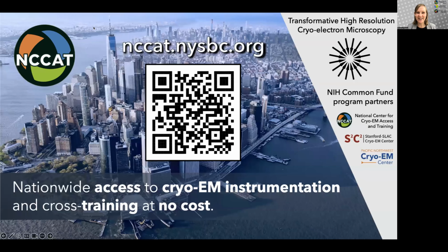All right, thank you, Nathan. And I'll turn over to Ed. Hi, I'm Ed here in New York. We offer a high-end instrumentation access program on our 4 operational Krios instruments. We offer a robust screening program where you can make use of our plunge freezers, a Chameleon, our Tundra, and Glacios. On that front, we've just received our 2nd Glacios, and we're installing that over the course of this winter. So hopefully we can bulk up that screening capacity.